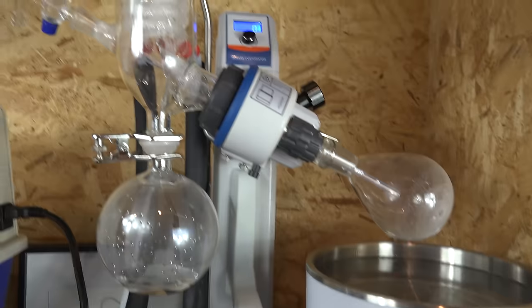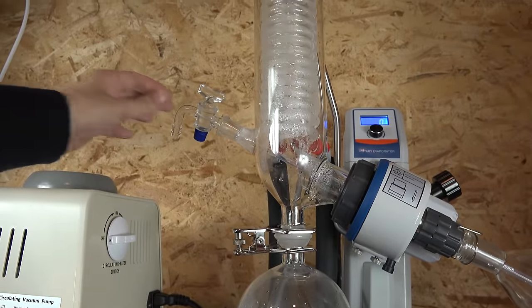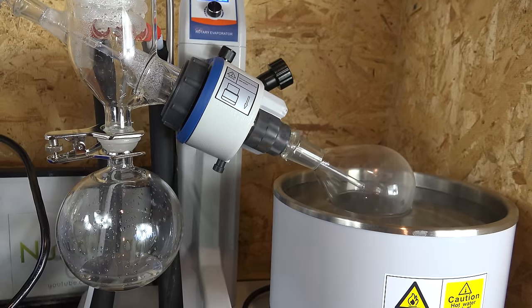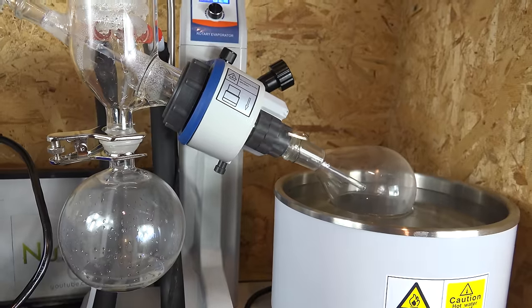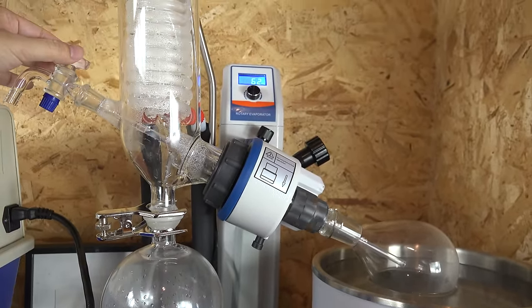It's not cheap, so for amateurs it's complete overkill and almost never needed. But for professionals that produce products on a preparatory scale every day, this is invaluable. I am extremely grateful that a lab equipment company, GWSI Labs, reached out and just gifted me one. I would never have bought one myself — they run into multiple thousands of dollars for a complete system.